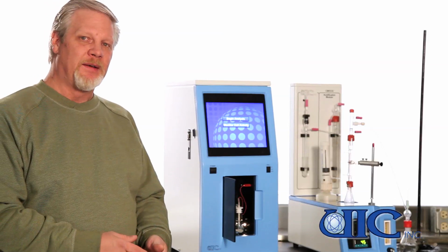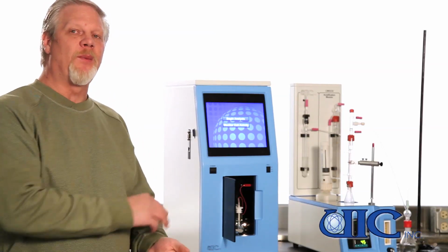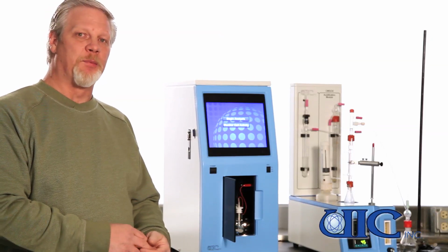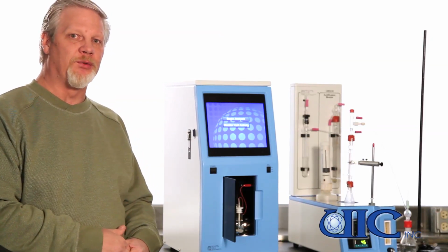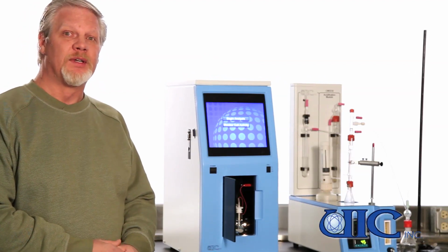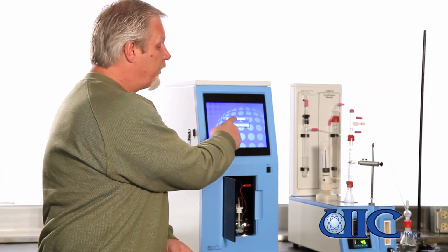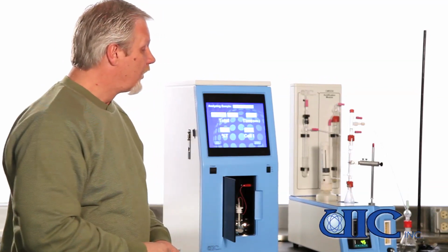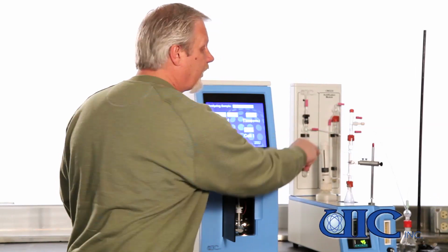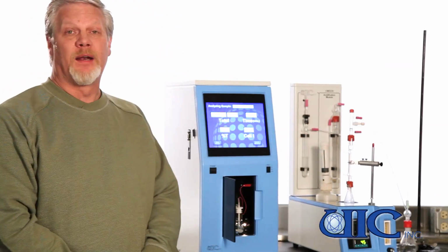If we were to add a new sample flask, we might want to use the monitor cell activity screen to monitor for purge activity to make sure that any CO2 is run through the system. What we're going to do right now is just hit begin analysis and run our blank. With begin analysis, we'll inject 5 mLs of acid into the acidification unit and let it run.